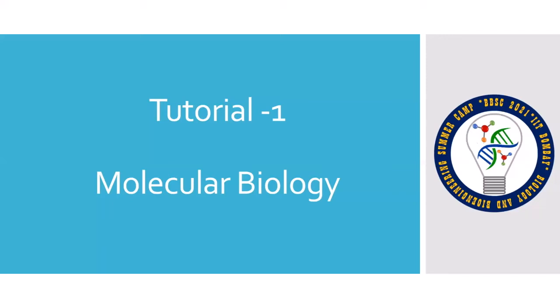Hello everyone. This is tutorial 1 for Biology and Bioengineering Summer Camp 2021. The tutorial aims at getting you acquainted with molecular biology and bioinformatics. In the first part of the tutorial, we will introduce you to the basics of molecular biology by walking you through PCR, RT-PCR, and cloning.